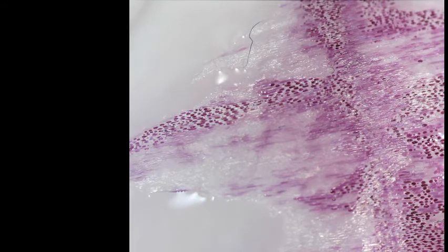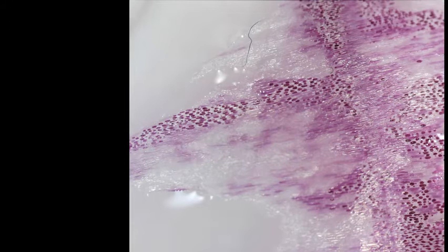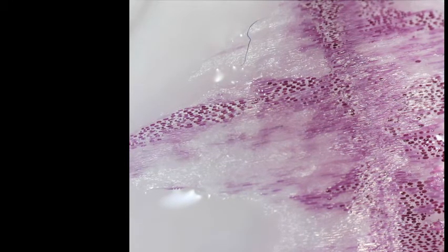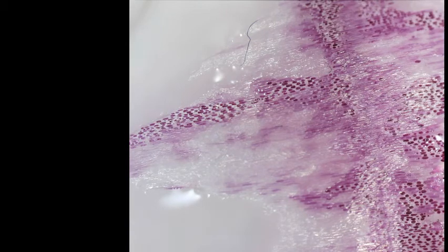It's so cool. You can almost see some of those cells plump up and almost pop. Pretty cool stuff to see happen before your eyes. Blow that video up so you can check it out.